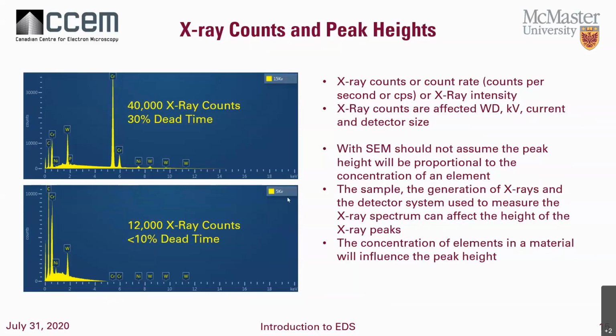So when we're talking about the peak height here, you shouldn't make the assumption when we're doing SEM that it's proportional to the concentration of the element. There is a tendency to do that. You do tend to have more of something if it's a larger peak.